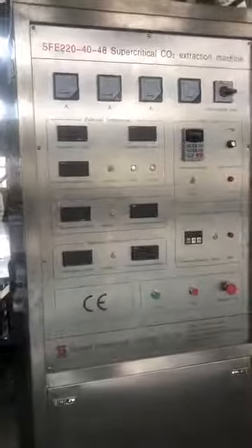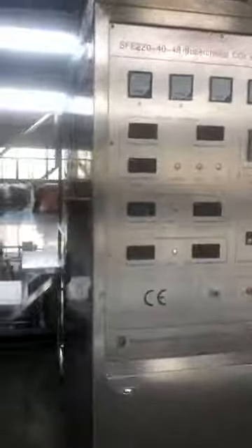This is our supercritical carbon dioxide extracting machine. These are the two extraction tanks. After extraction, the efficient material will come from the separation unit and this extraction unit.